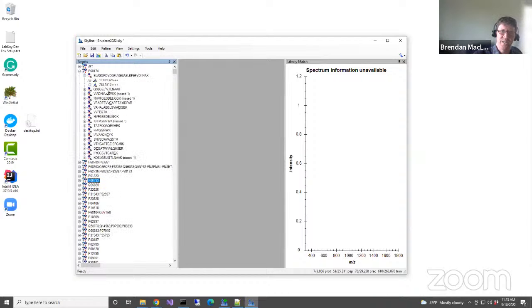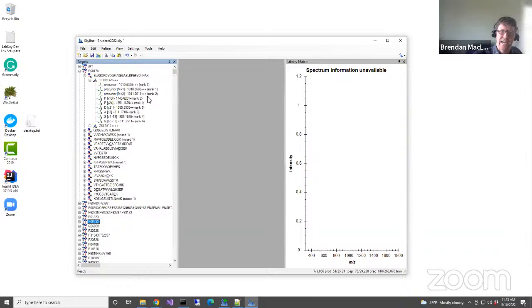And if I expand here, you can see that I now have these precursor transitions, which don't have these library scratch marks. These are MS1 transitions, and they're the isotopic distribution that we've been talking about for DIA: monoisotopic, M+1, M+2. And so we could extract those too, and those would give us new information. They would add some scores to our mProphet model, and they do add a little bit of value, but actually DIA does do pretty well without these precursor transitions. And again, I opted for fewer transitions to make it a little bit more teachable. But that's a long answer to that one.